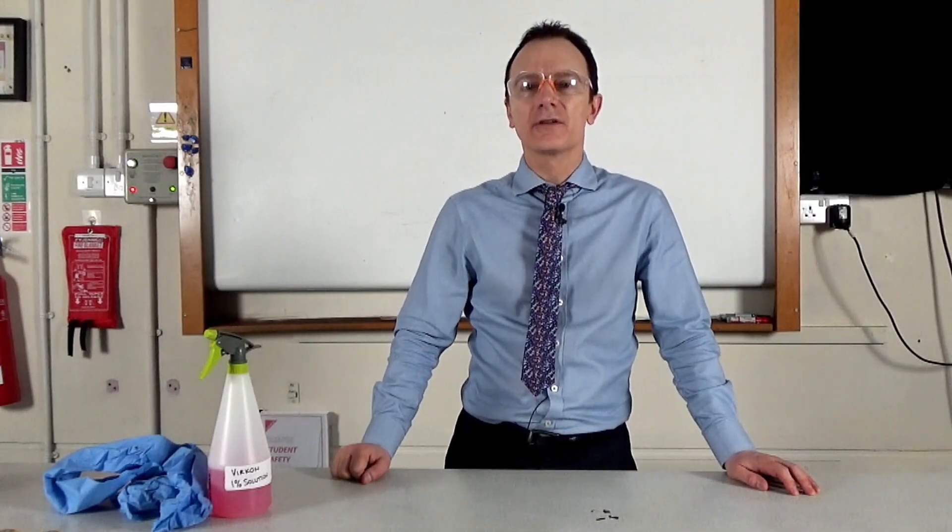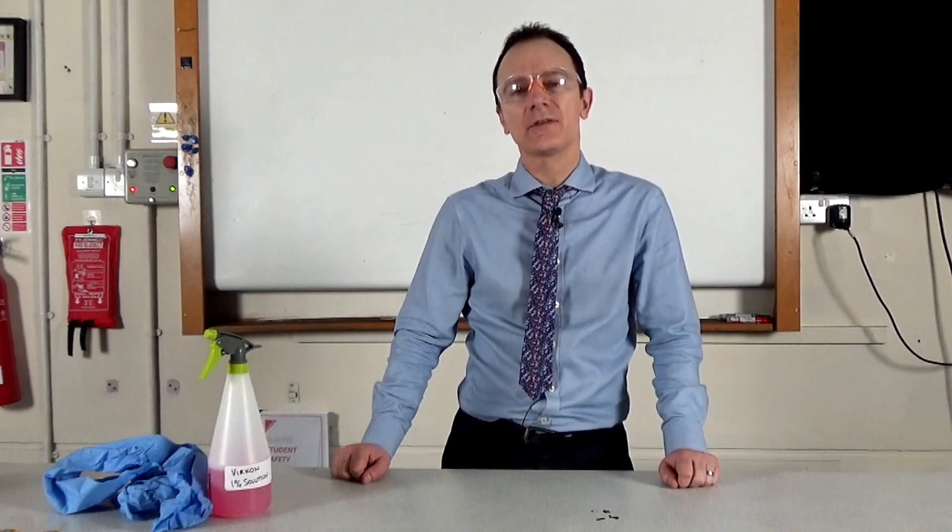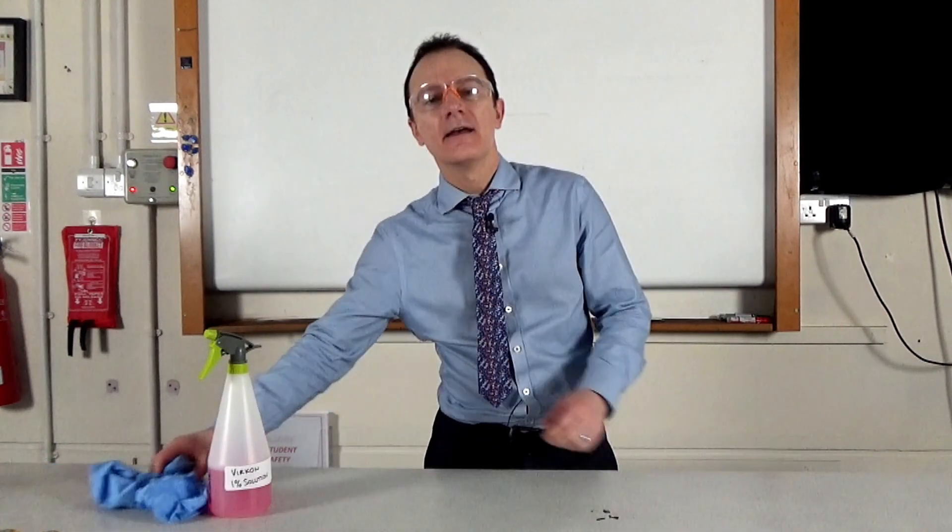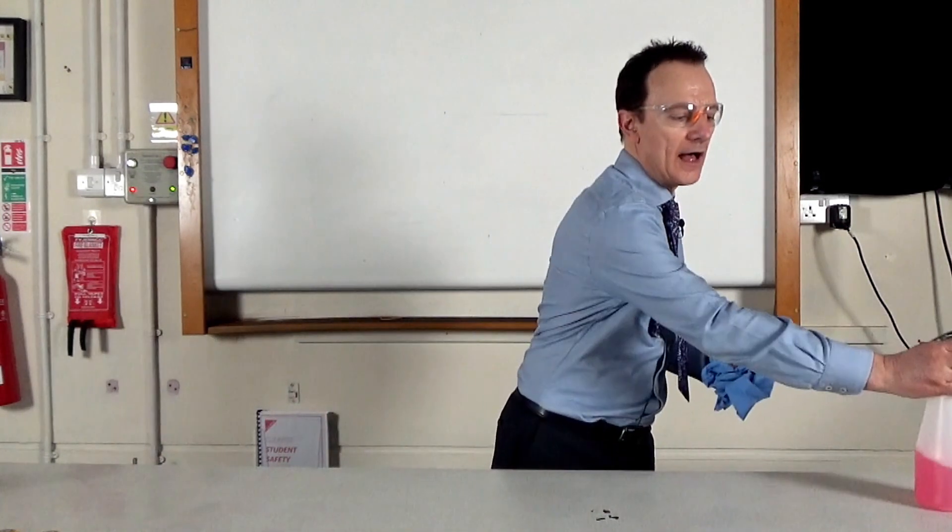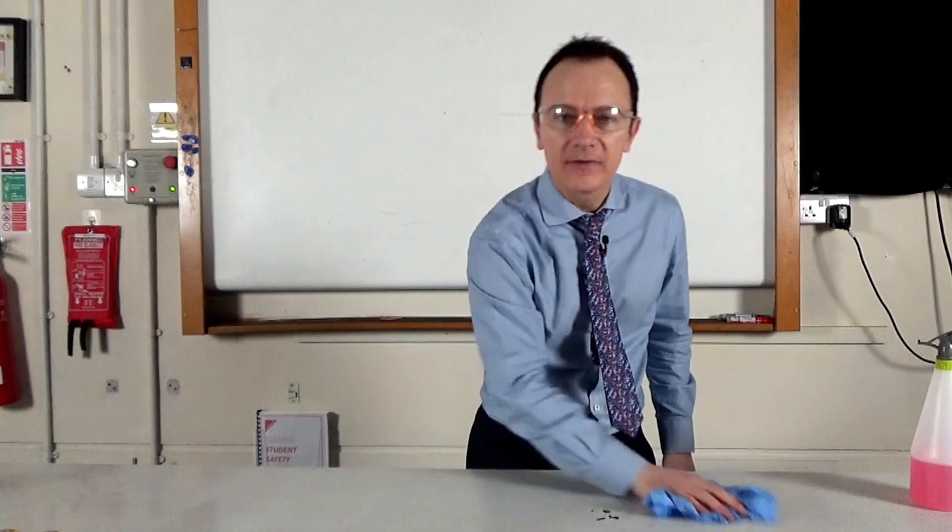Students need to prepare for the practical by putting on their safety glasses, tying back long hair, and then spraying down their working area with the vircon disinfectant and wiping it dry with a paper towel.